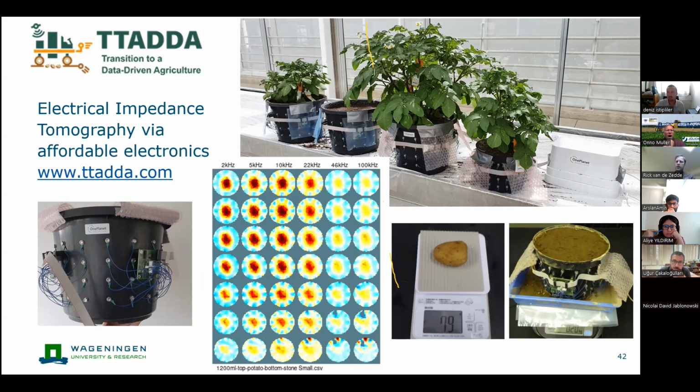If there's a blob of water in the soil, or some object that has a slightly different property than the rest of the soil, then you can actually reconstruct this. So we can reconstruct not the root, that's too small, but we can reconstruct a tuber that is growing on the root of this potato plant. And this actually worked amazingly well. So we were quite happy with it. And the electronics that we use here are extremely cheap. It's only a few hundred euros and you have a bucket sensor. But then it's only for tubers, not for roots. And we have been translating this to field situations.